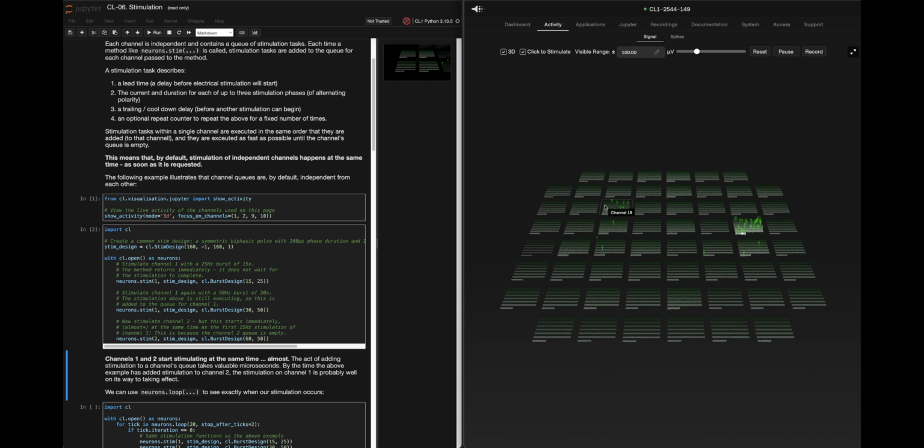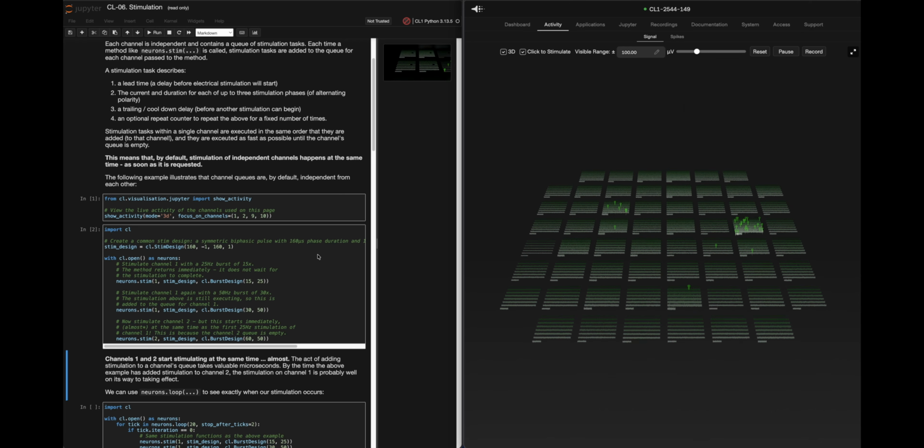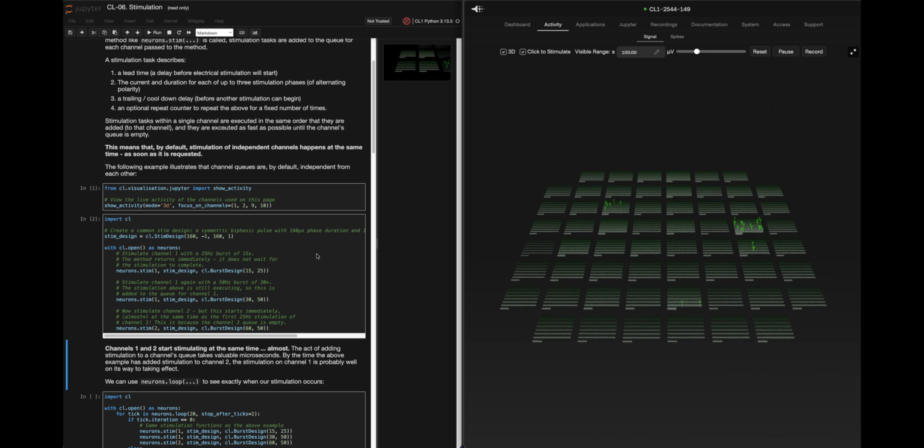To be very clear, that's typically from what I have found. Every culture is different, but I have worked with probably half a dozen different cultures at this point from Cortical Labs, and I can say that you really don't want to do that even on one channel. On all channels, you don't want to do that. It just causes problems. It's going to make your life harder.